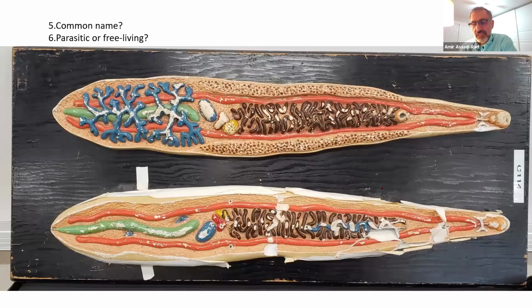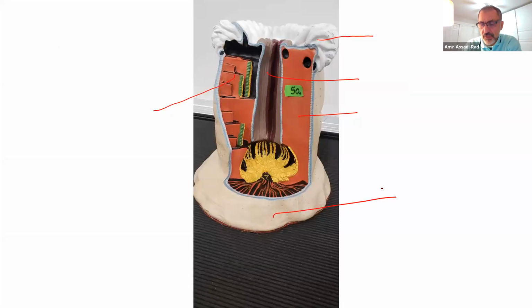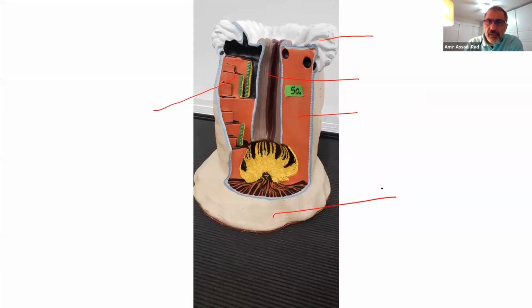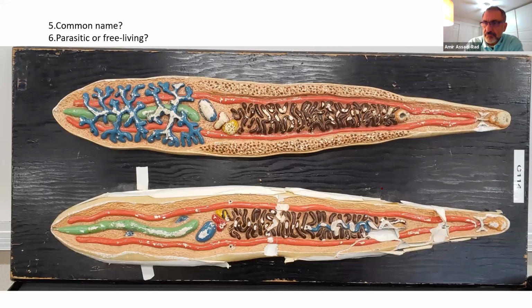This is your Metridium, class Anthozoa, right? We didn't go over class Turbellaria. You know this. Okay, class Trematoda. Oral sucker, pharynx, esophagus, cecum, ventral sucker. This is all uterus, yolk glands. Do not worry about this one, but this is the ovary, and this is the seminal receptacle. This is the excretory bladder, the green. The blue is all testes.